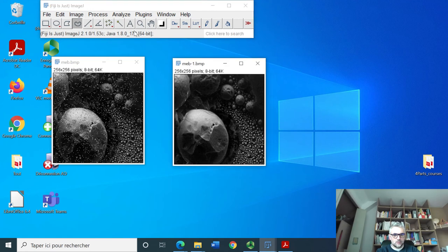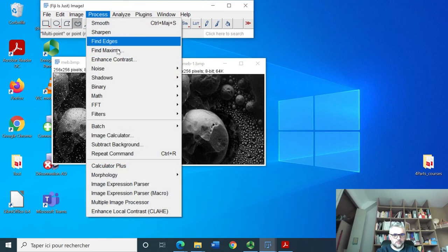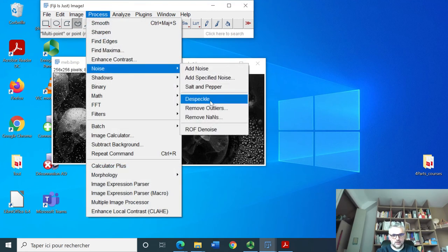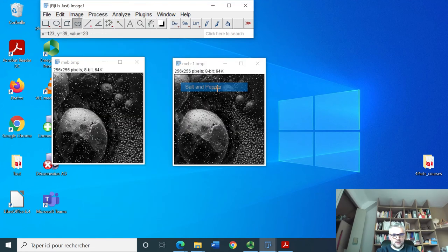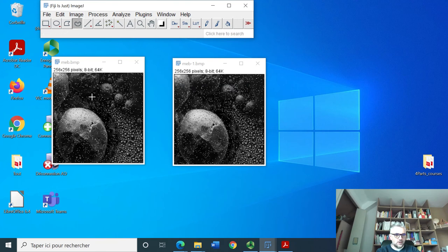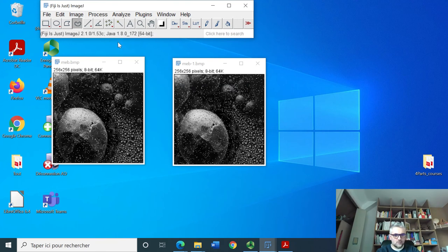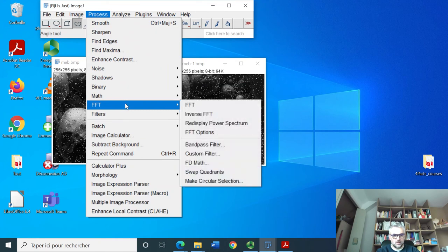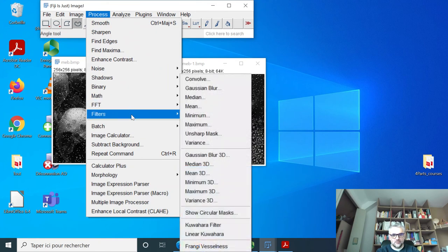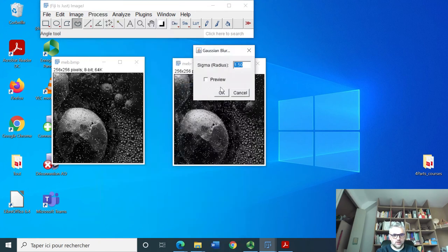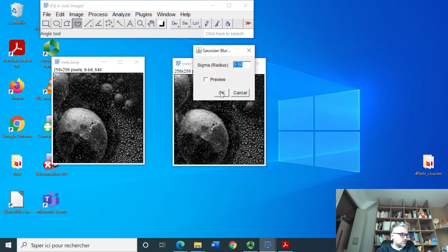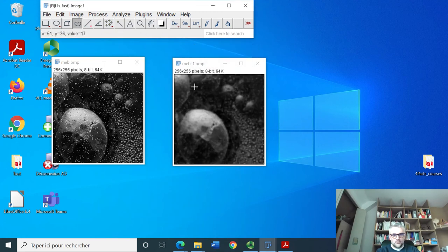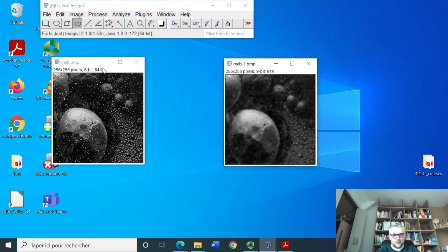We're going to try to denoise this image which has salt and pepper noise with a filter called gaussian blur with a radius of 1.5. This is what we have.